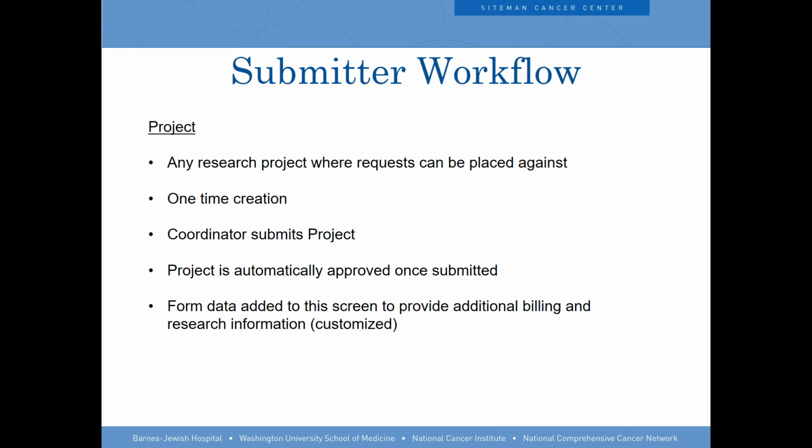Now, switching gears to somebody who's actually going in and creating a project, and just talk about their workflow. But again, the project is set up where you can create requests against it. It's a one-time deal. They don't have to create multiple projects, especially if it's one that they're still doing collections against, and they're still submitting services against those specimens. In our environment, they are automatically approved, like we discussed.